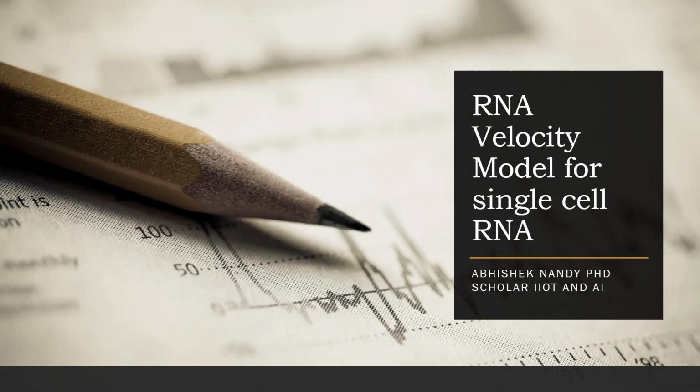Here we look at the RNA velocity model for single cell RNA. In this video we'll look at how the RNA velocity model idea came into the picture when I was researching my PhD content. It's my daily research, and it's a very important topic that I came to know about, and I will go through all the information. But the entire code application of the demo that you will see, I will show in a proper manner, step by step, in subsequent videos that I intend to create. It would be a series where you get the information of it.